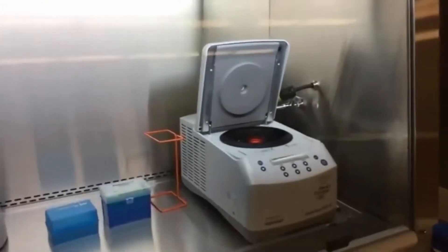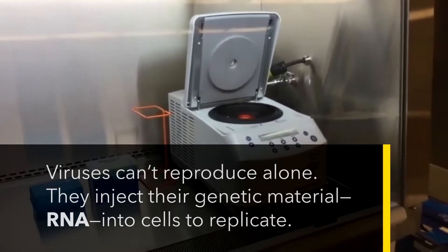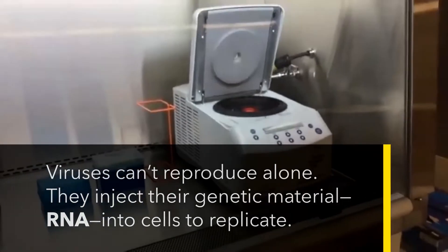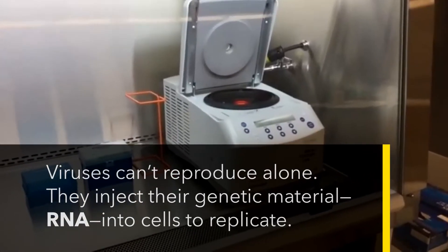Here is a more close-up view of the centrifuge used for spinning down the samples and separating the viral RNA that may be in the patient sample from all the rest of the material that comes in the sample tube.